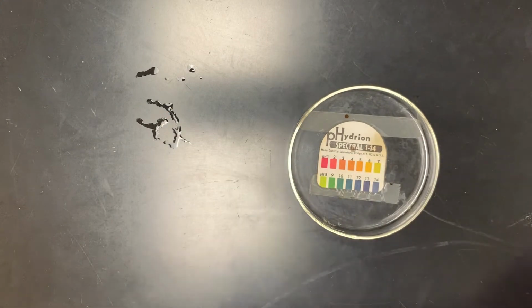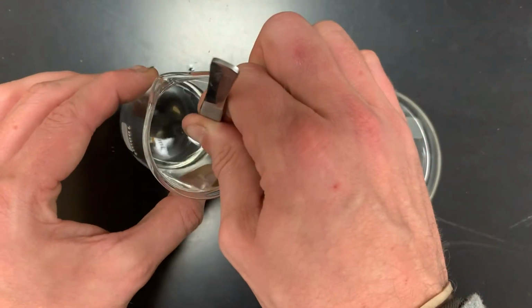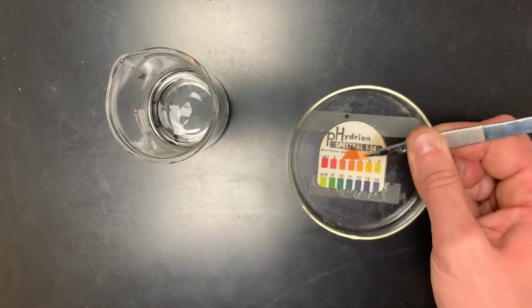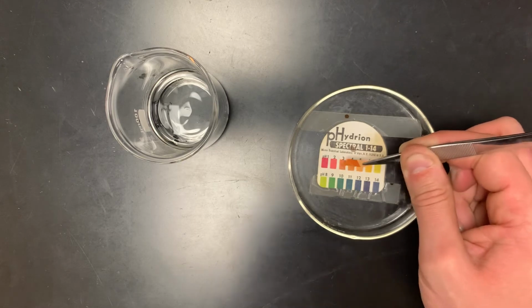Okay. Next, we'll take a look at zinc nitrate. Again, we've got zinc, another transition metal. Okay, so perhaps we're starting to develop a trend here. Maybe. This looks like maybe it's a pH of about 3 or so.